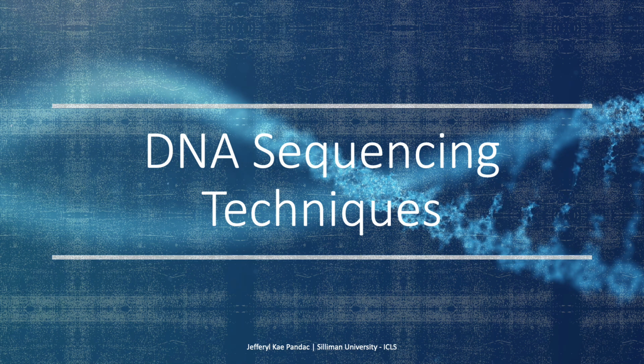Good day, students. In this lecture, I will be talking about the important laboratory technique, which is DNA sequencing, or the method or technology that is used to determine the order of the four bases of DNA, which are adenine, guanine, cytosine, and thymine. Also, the different techniques of DNA sequencing will be tackled.